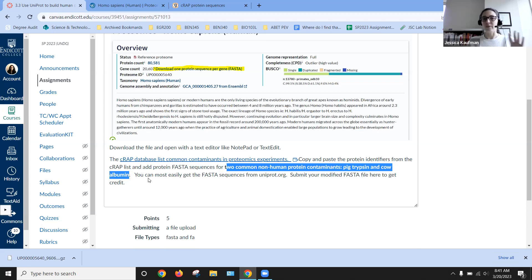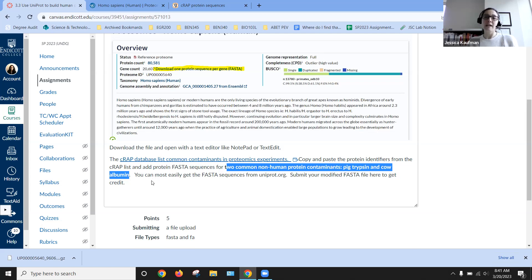And so we want to make sure that we have both of those in our database. So if those contaminants are in the sample, they map to the right location.